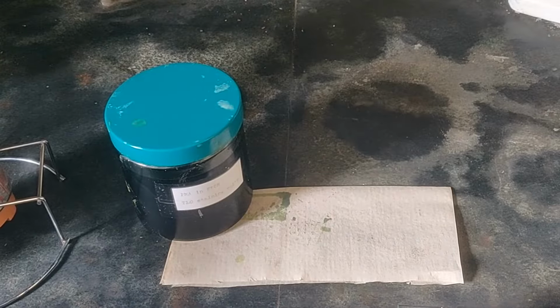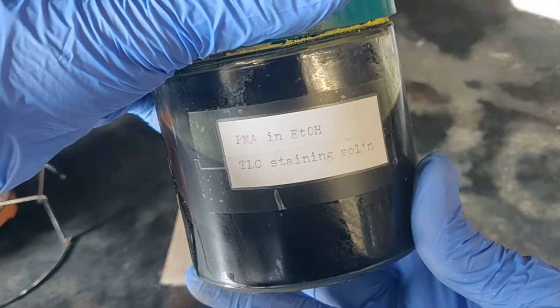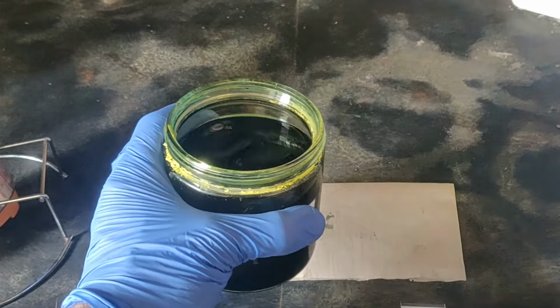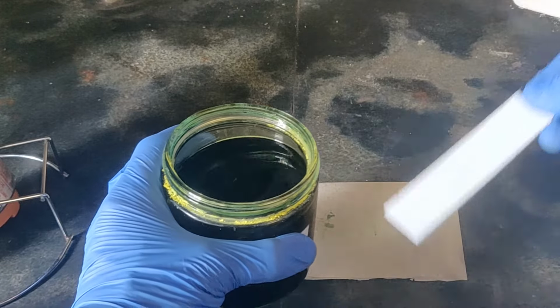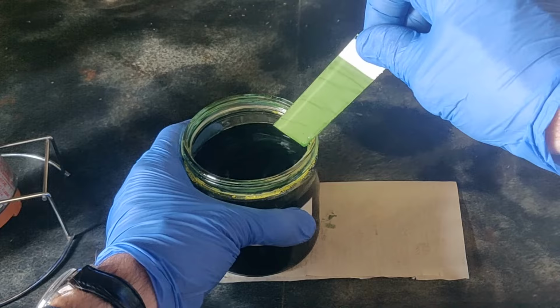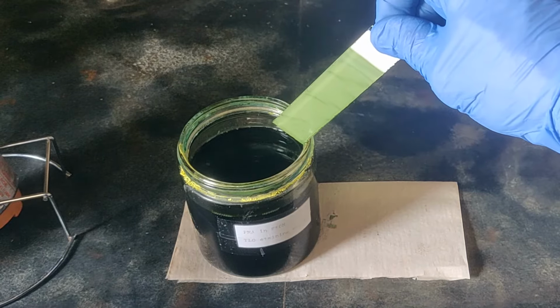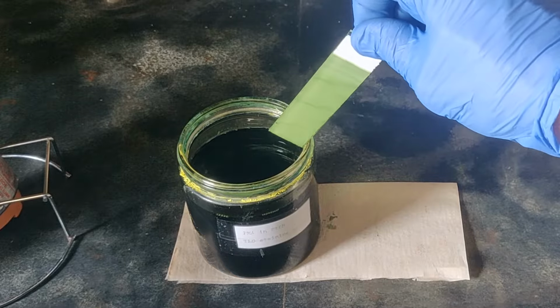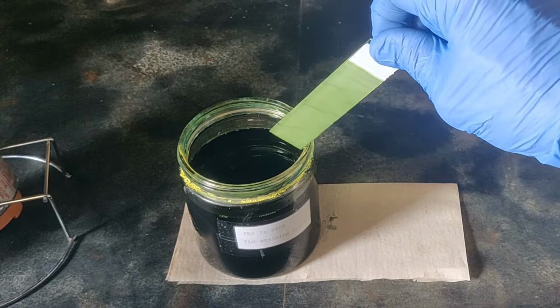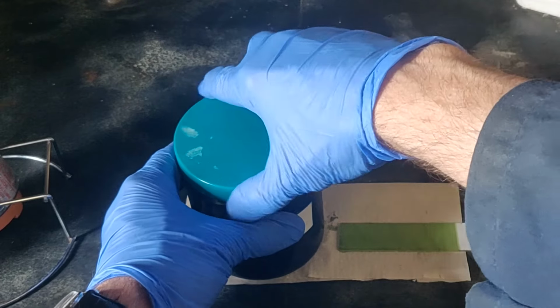The plate is now ready to be visualized, in this case using an ethanol solution of phosphomolybdic acid, PMA, since the spots don't visualize with either UV light or iodine vapors. Hold the plate with forceps or your gloved hand and dip it quickly in and out of the PMA solution. As you would with all other chemicals, avoid direct contact with the PMA solution since it's corrosive and thus an irritant to skin and eyes. Allow the heavy drops of solution to drip back into the jar before touching the plate to a paper towel.